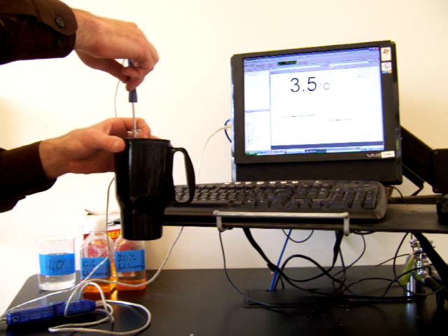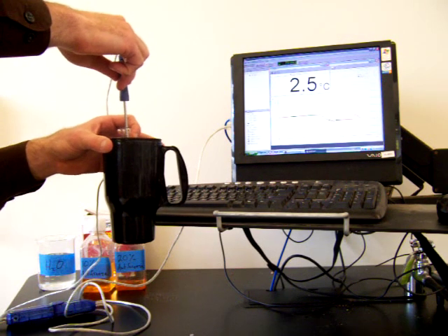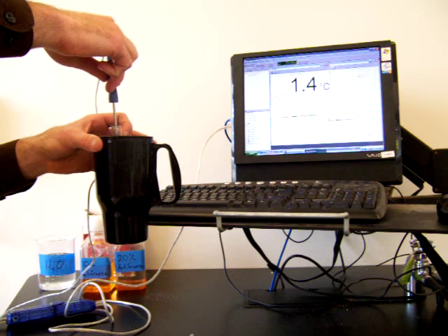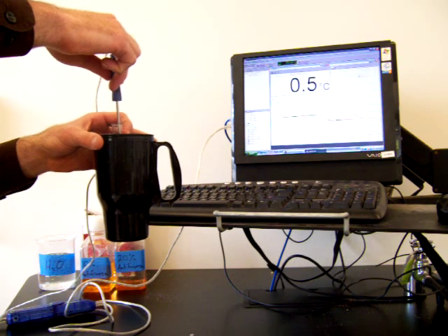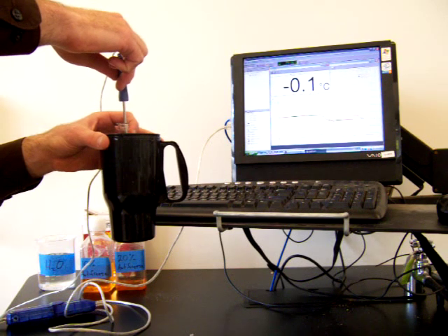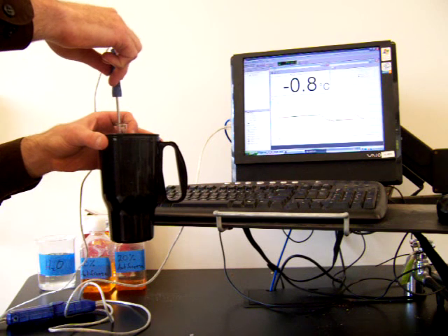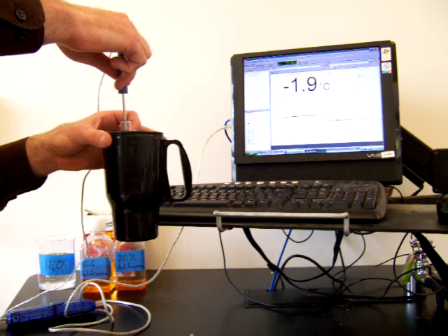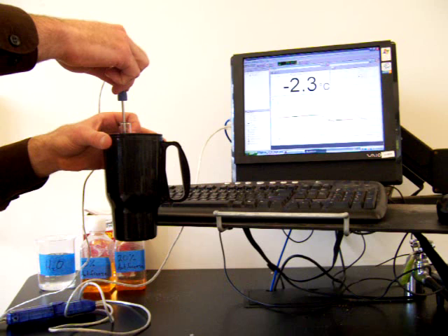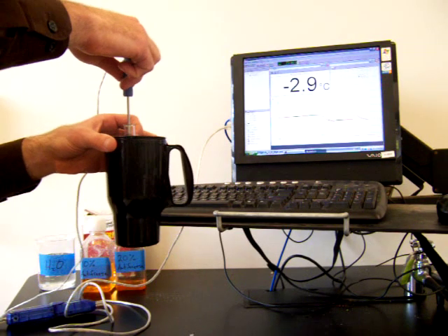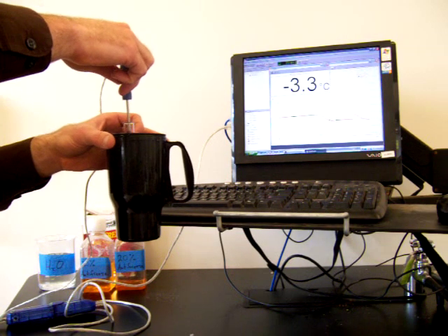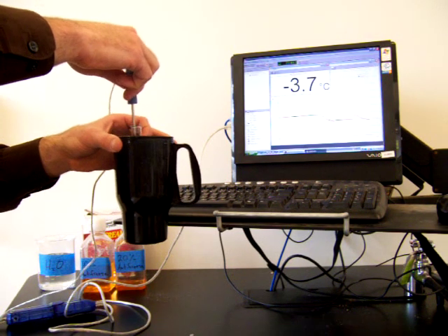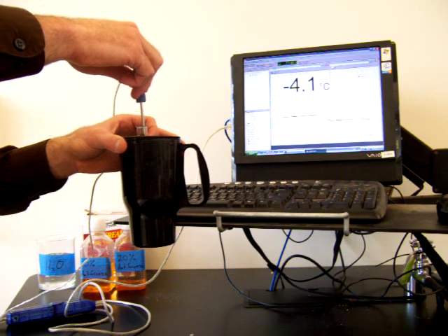We'll expect this one to freeze at a lower temperature than the pure water because it's a solution. And we know based on freezing point depression that solutions are always going to freeze at lower temperatures than the pure solvent. So the solvent here is water and then we have the solute antifreeze dissolved inside of it. So we're down to negative 2 degrees Celsius. Still dropping. We have a nice cold ice bath. It's going to cause this to freeze pretty rapidly.